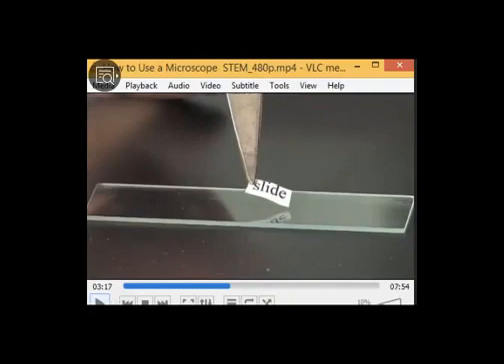Okay, but this is just to show you the procedure. In the next experiment, in place of this paper, you will use the cell. So today's experiment is just to show you the procedure. That is why we are using this paper. Or you can cut any one letter. For example, if you cut the letter E, you can make the slide. But this slide is not real. The real slide we will make in the next experiment.